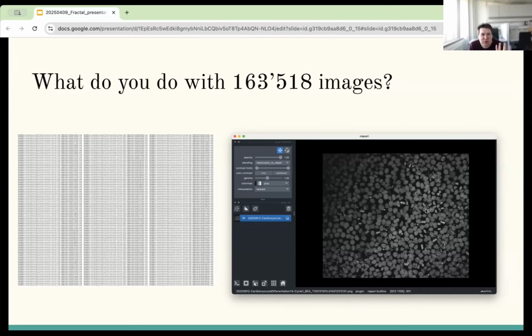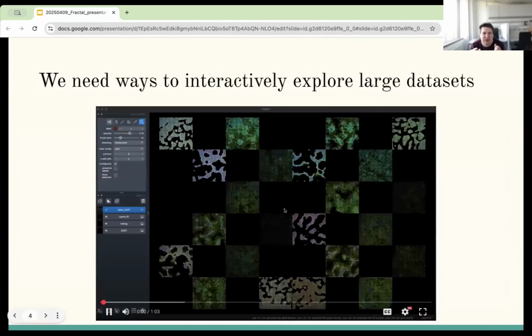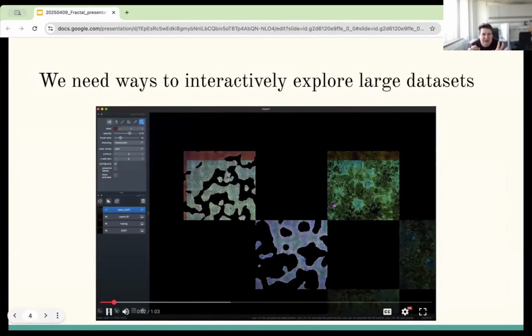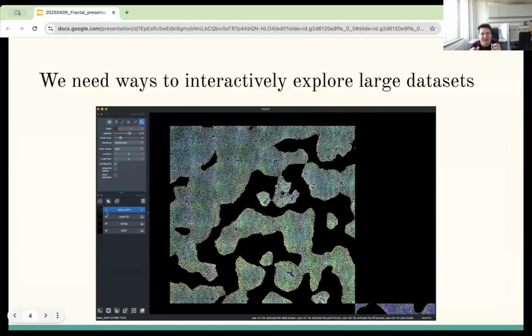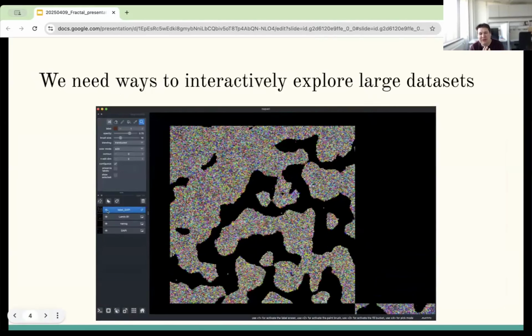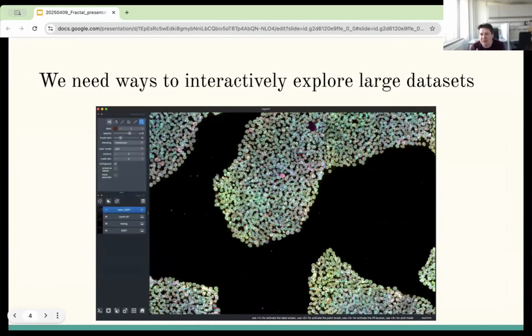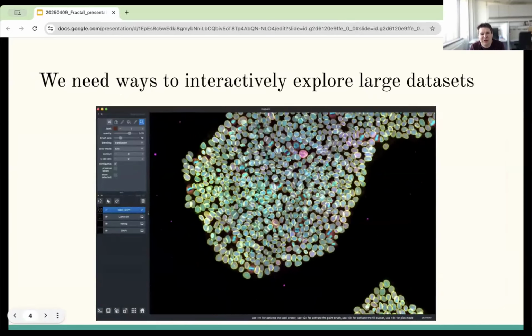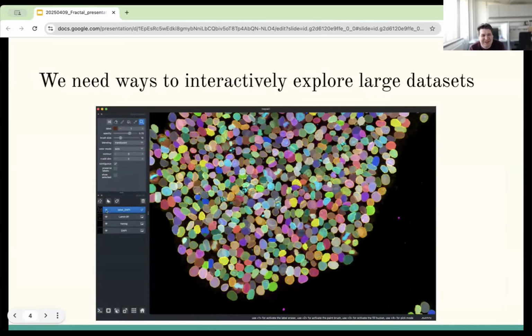Because what we really want to do when we have these large data amounts is make them accessible for much more interactive exploration and browsing, where we can have very zoomed out views, but we can also dynamically zoom into data and stream only what we need, both from the image data that we actually imaged, but also from results of processing that we created on them to verify, do our images look like we expect?